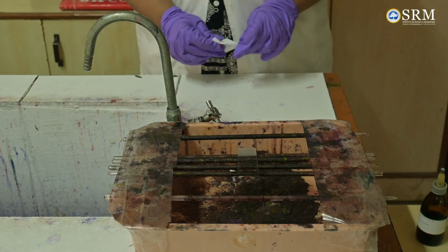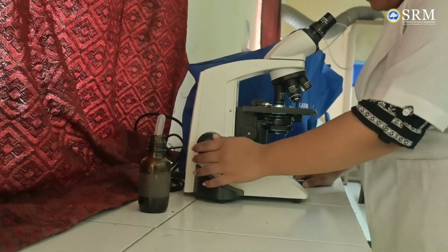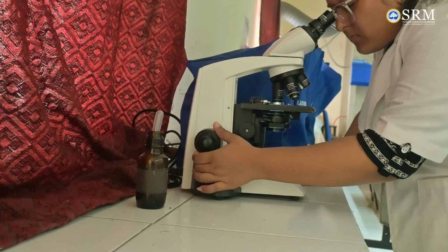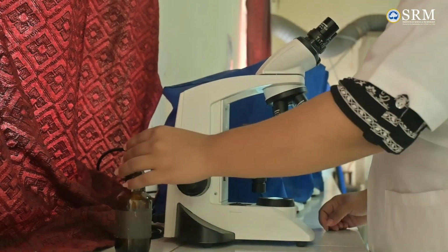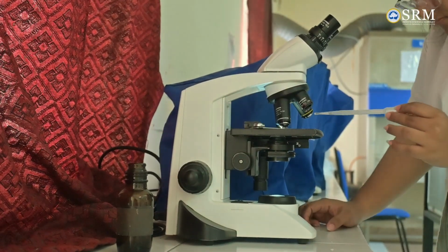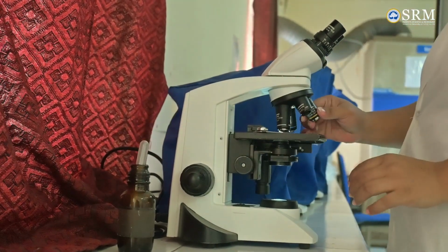Then we observe the slide under a microscope. Now we are going to observe the slide under the microscope. We adjust the slide and then we move forward to observe it under the 40x. And then finally, for a clear vision, we observe it under 100x. Before observing it under 100x, we put a drop of oil on the center of the slide and adjust it to 100x and then observe it.